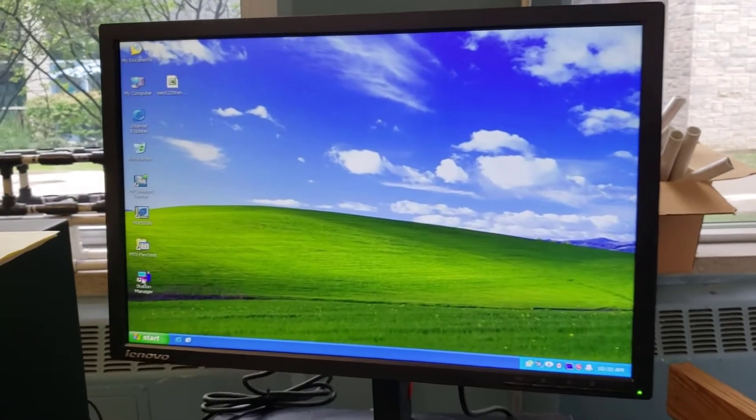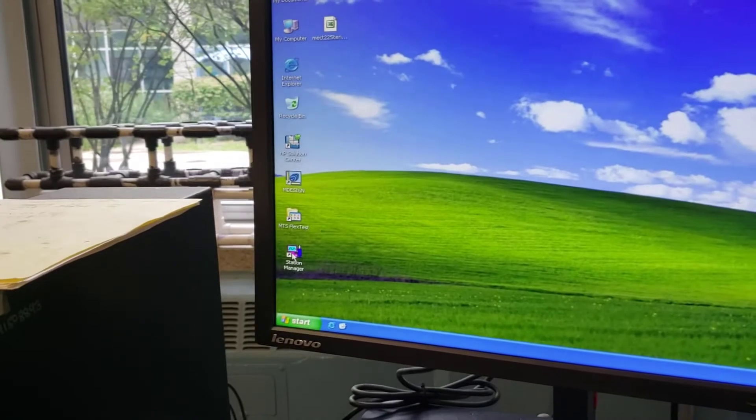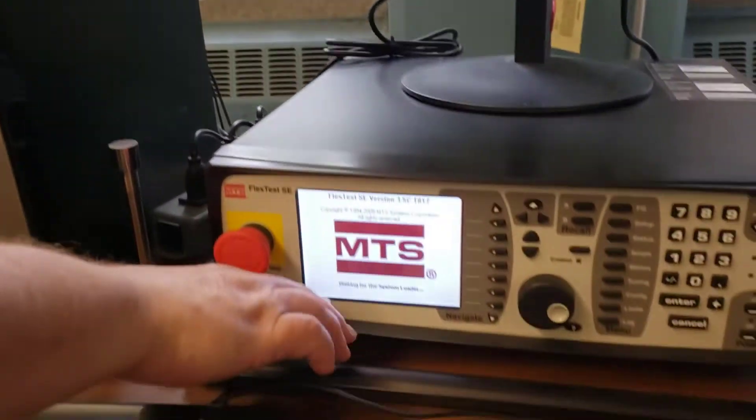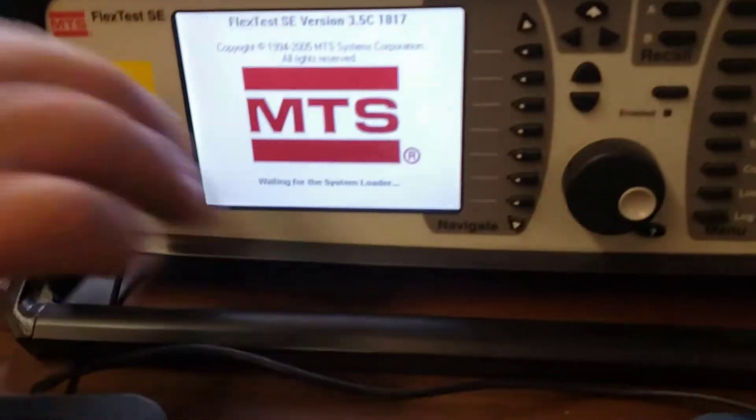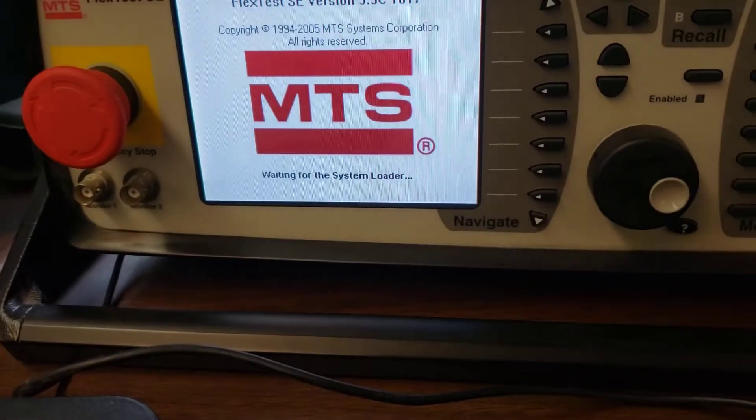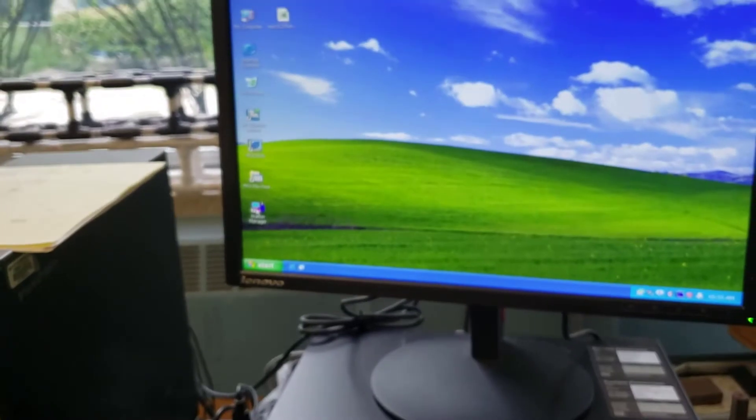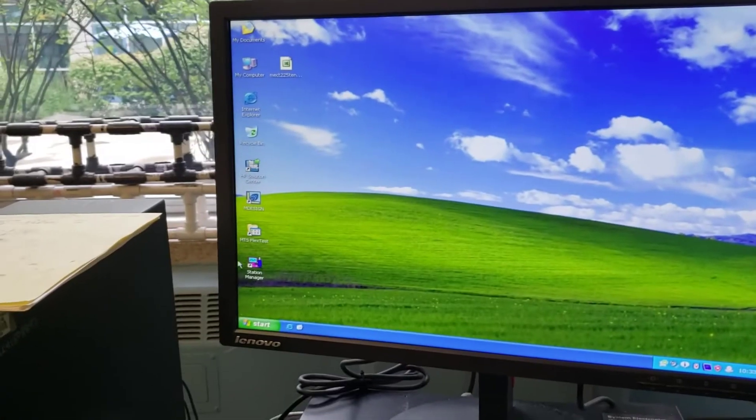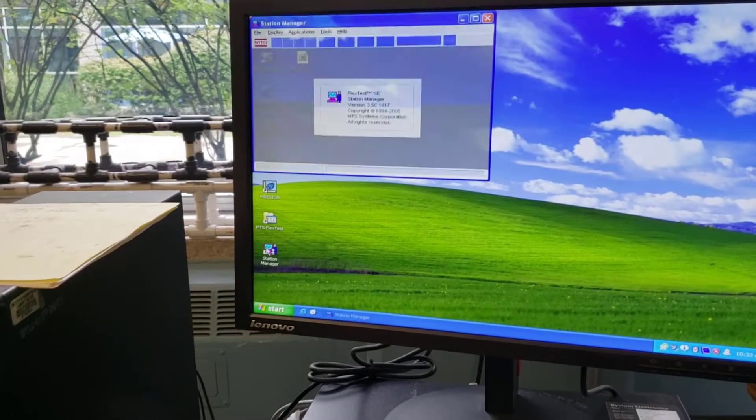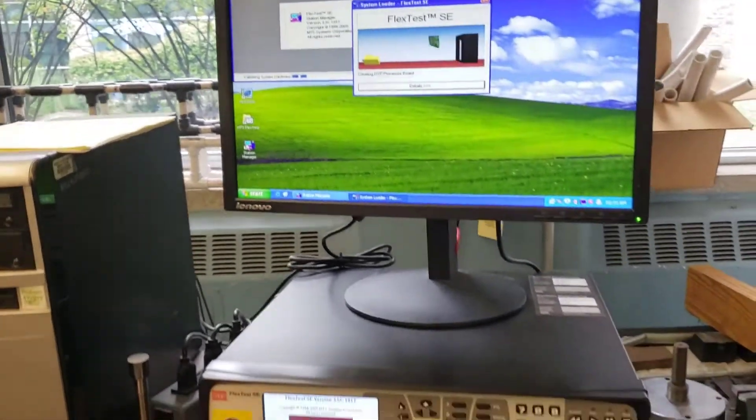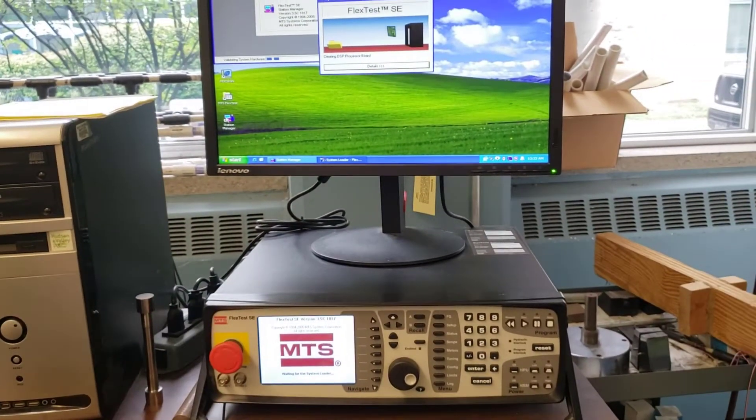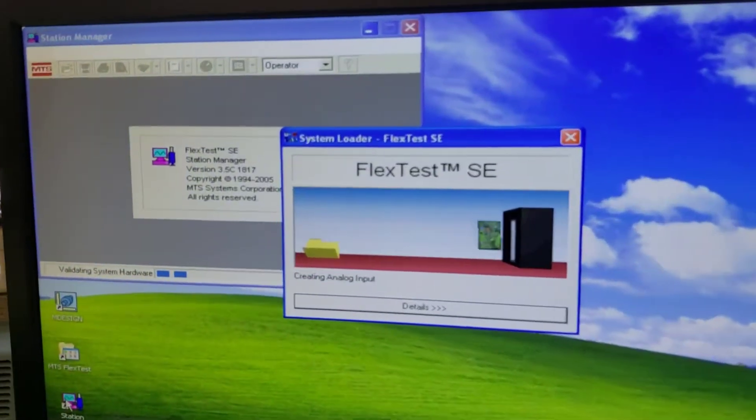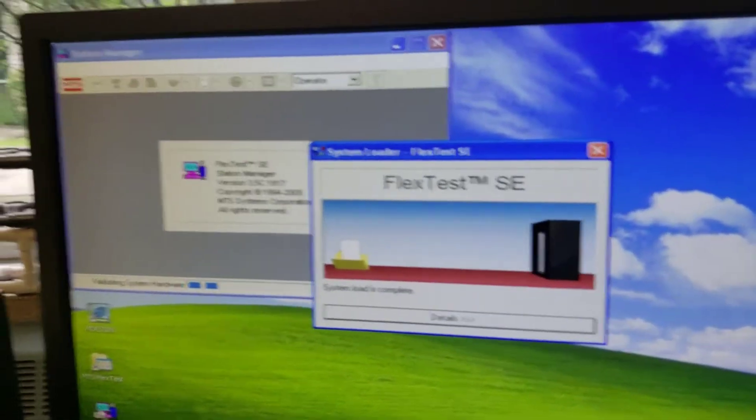We run the station manager, and do not run that until you see the MTS here waiting for system loader. You want to be able to see that logo up on the computer here below. Just so you understand, this box below can run all the tests, it's just that you have to manually push the buttons, it's very analog. This gives us a digital interface, which is much easier to see.